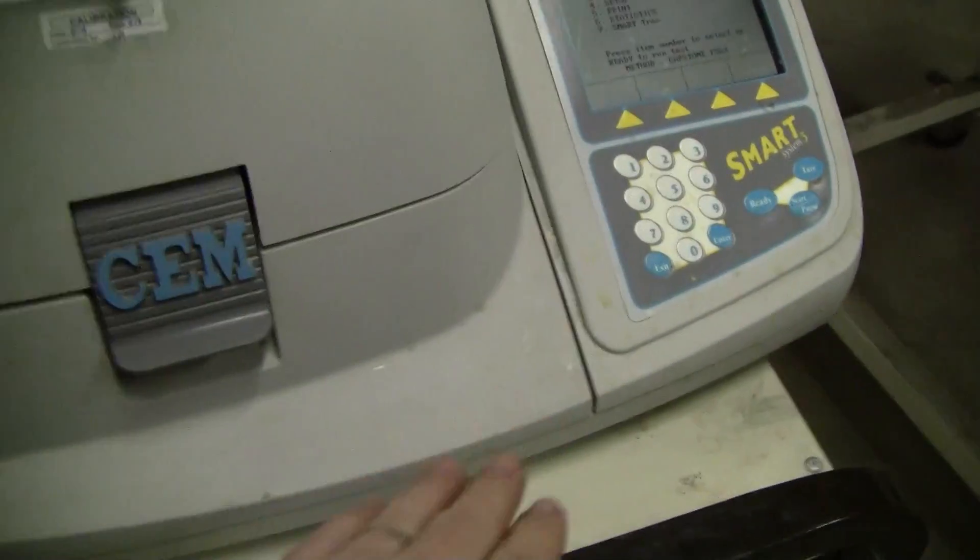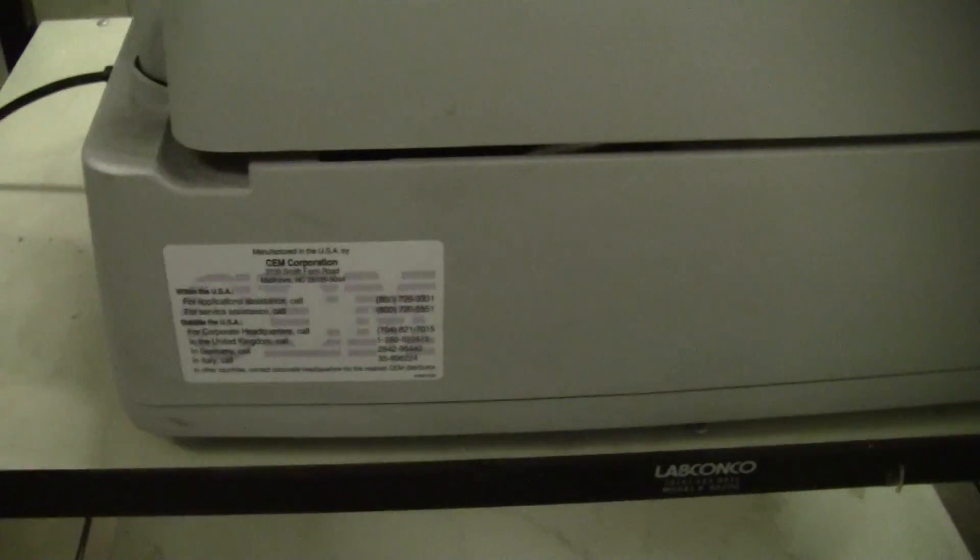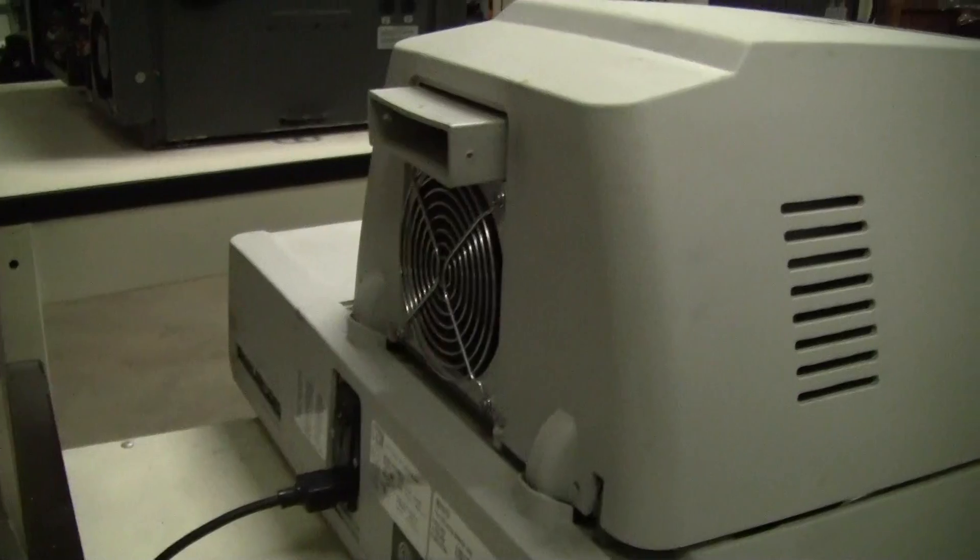The unit does have some cosmetic wear and tear on it. Here's the rear of the unit — let's take a look at those communication ports.